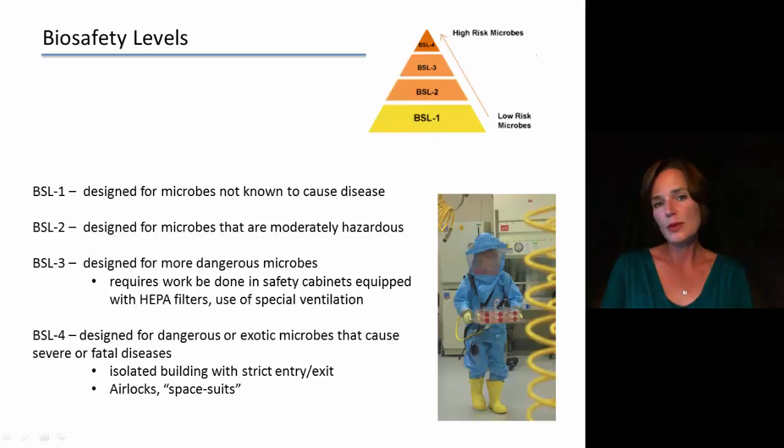airlocks. It would be what you see in this picture right here, where individuals have to wear special kind of space suits that are going to be airtight, that basically prevent them from inhaling or touching or coming into contact with that microbe that they're working with in any way.